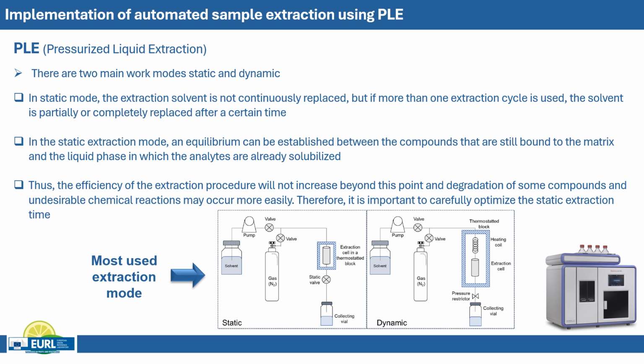Thus, the efficiency of the extraction procedure will not increase beyond this point, and degradation of some compounds and undesirable chemical reactions may occur more easily. Therefore, it is important to carefully optimize the static extraction time.